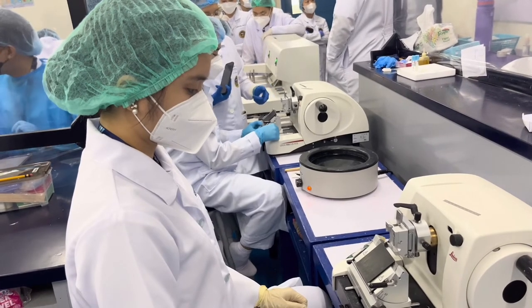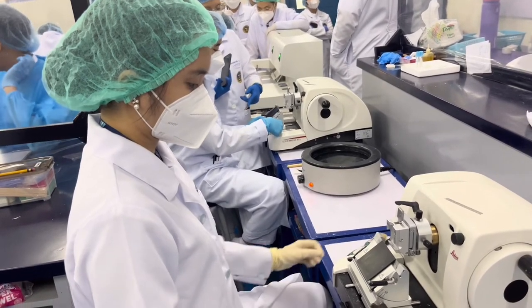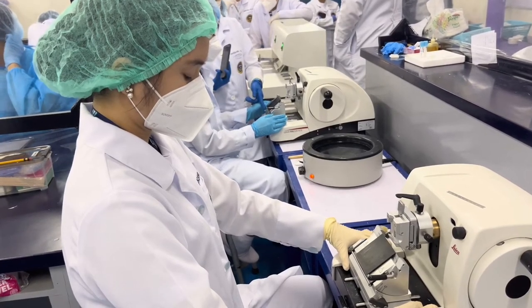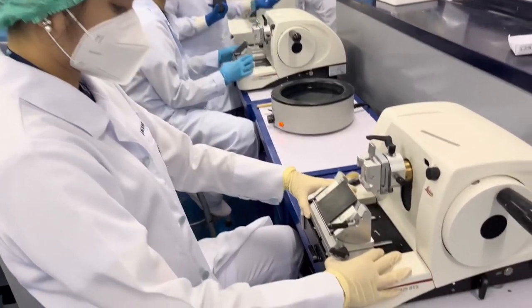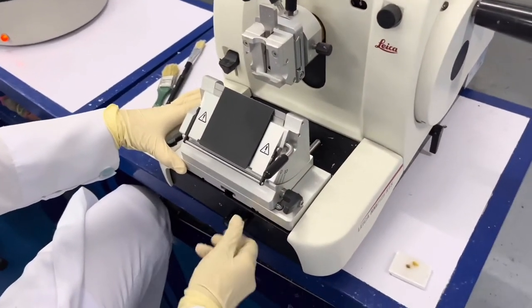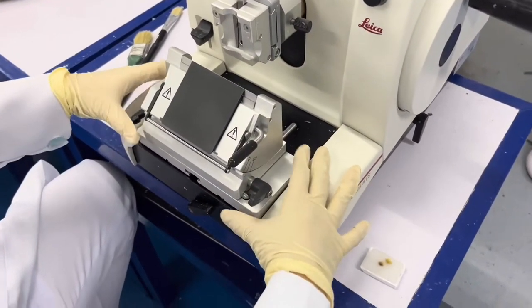In front of me is the microtome. For this video, I am going to demonstrate how to set up a microtome. I am holding the blade holder base and pull it backward. I lock the base by turning the lever to the right.